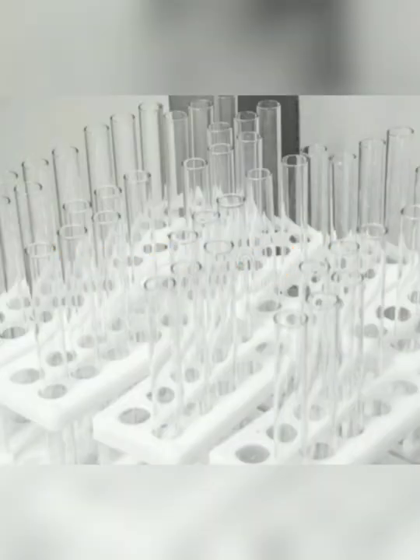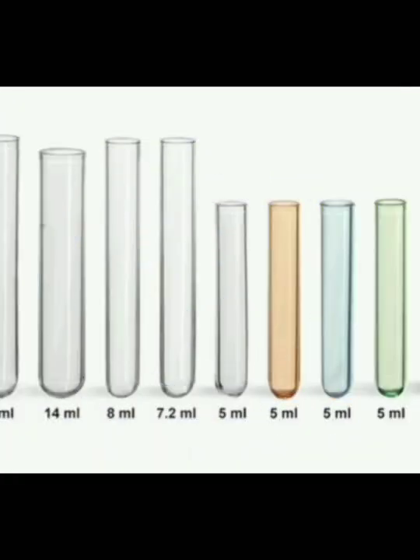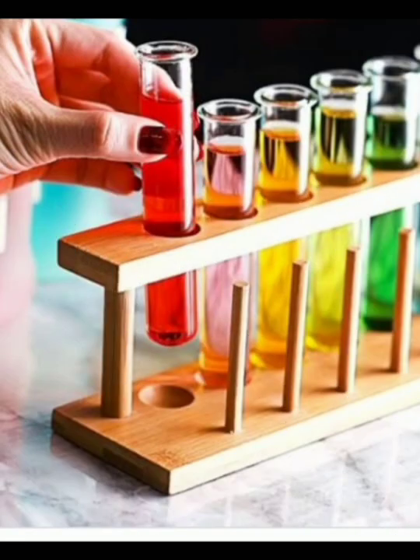Test tube. A test tube, also known as a sample tube, is a common piece of laboratory glassware used for conducting various tests by taking small amounts of reagents. Test tubes of different dimensions are available. Test tubes with smaller dimensions are known as semi-micro test tubes. They are kept on test tube stands.